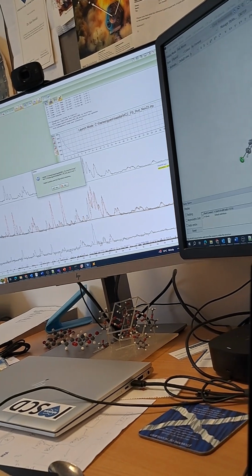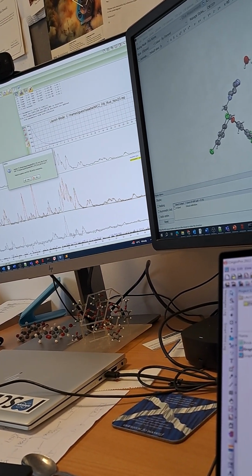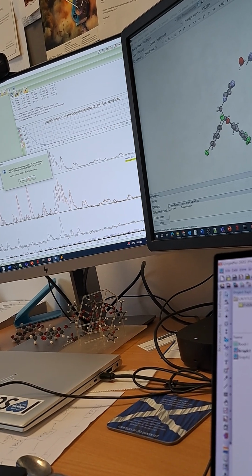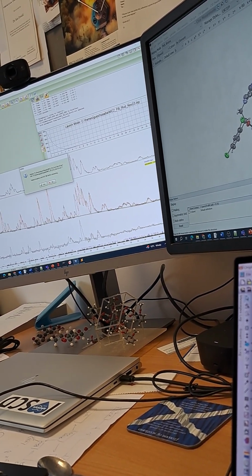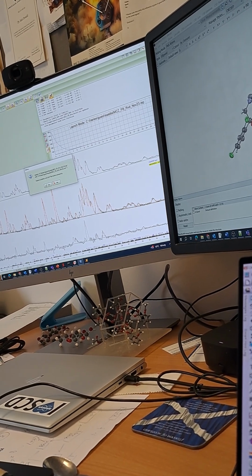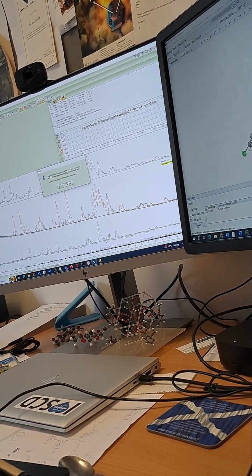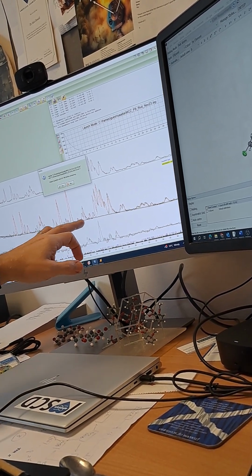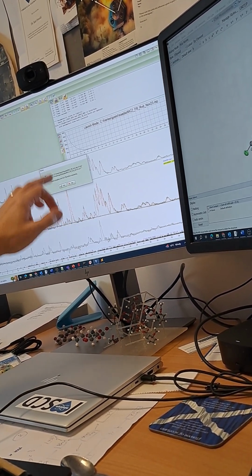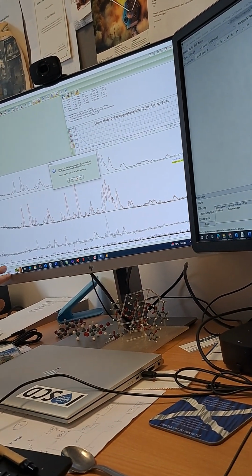It will just take them off. The Rietveld uses an intensity to say, oh, right, that's the scale I'm meant to be on. Okay, I'm going to scale it to be at a level of 700 rather than 45 million or whatever it was. So the Rietveld does use the intensity from the pattern, and that's why it's so small, because the peak is not at an intensity. But you can see here that these two fit.